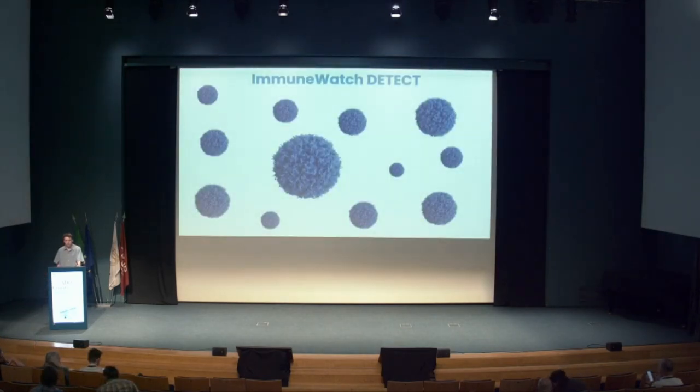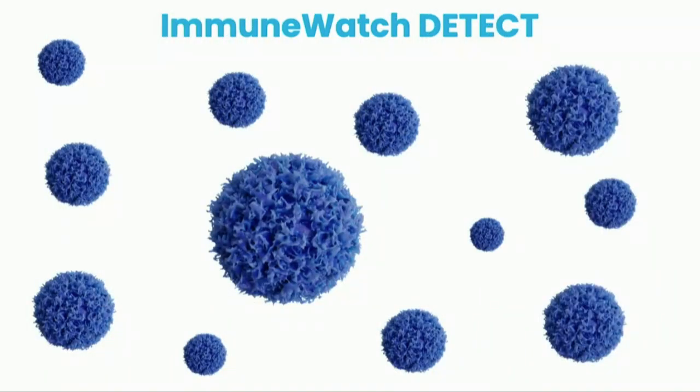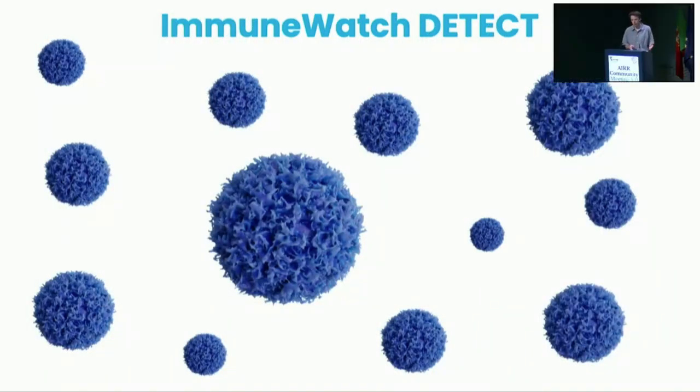All right, so my name is Max. I'm from ImmuneWatch, and today I'm doing the lightning demo on ImmuneWatch DETECT. So what do we have here? We have a TCR repertoire, and as always, it's a varied repertoire, many different clonal types, and a fundamental question arises: what are these T cells recognizing? What is their specificity? Now, we have developed a software solution that is called ImmuneWatch DETECT that answers exactly this.